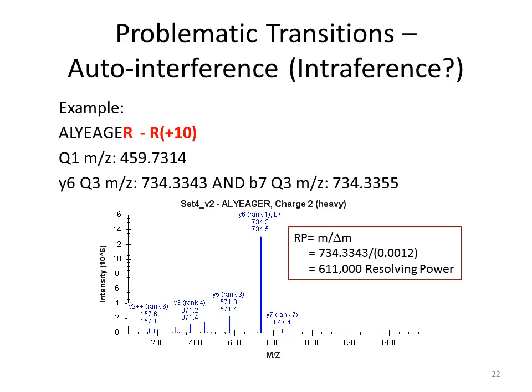So the way that you determine the resolving power required is you take the delta mass, these are rounded, but you take the difference in mass between these two ions and you divide it into the average mass of those two ions. No, you don't have to multiply by anything, sorry, scratch that. But if you do this process, then that is the resolving power that would be required, and that would take over a second every time it would generate a scan like that. And so the best thing is just to avoid that transition and not use it at all.